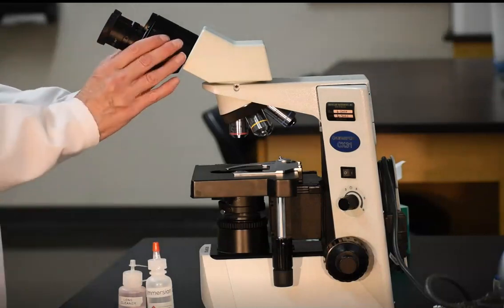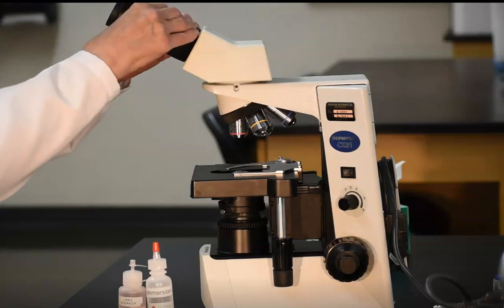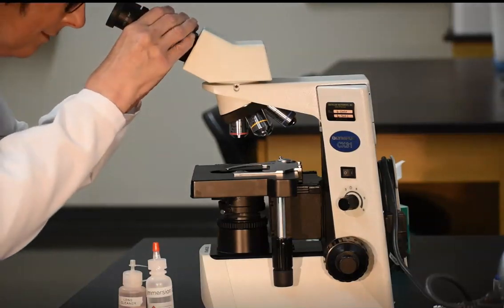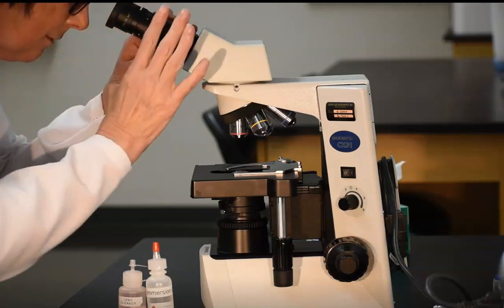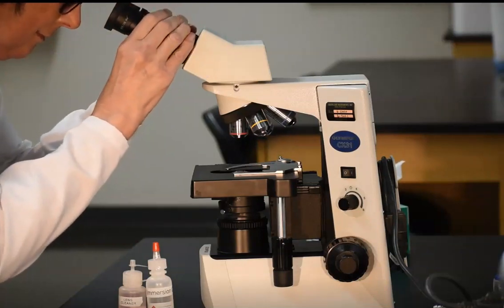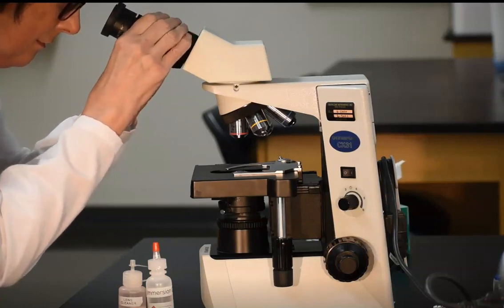The easiest way to do this is to start with the oculars all the way open and try to look down through the lens. Your face should be a short distance from the lenses. There's no need to press your face against the lenses. If you do that, oils from your skin or makeup will get on the scope and you'll need to spend more time cleaning it at the end.